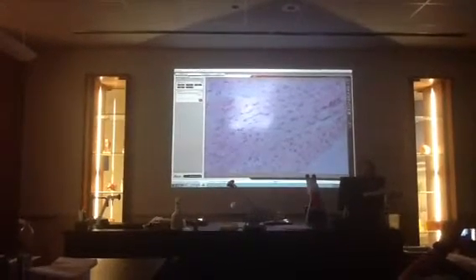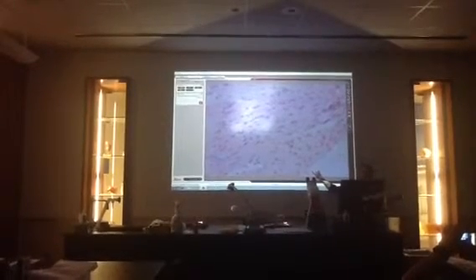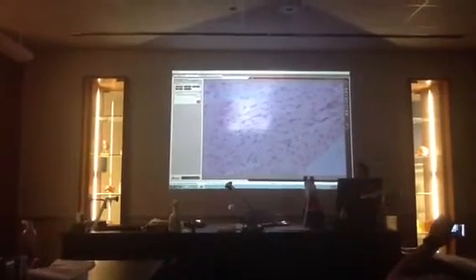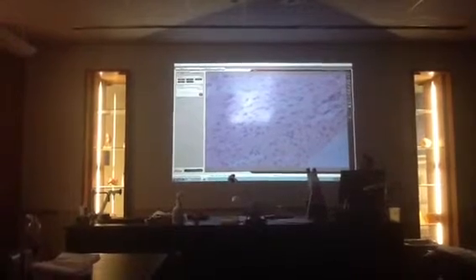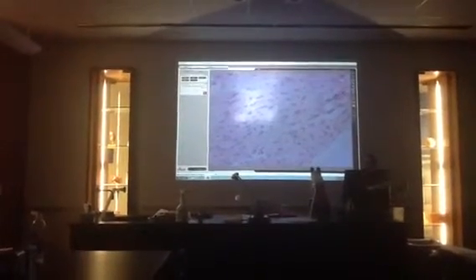Is the longitudinal layer adventitia? No, the adventitia is going to be the layer to the outside, you can barely see it right here. Usually that layer is not high on the list of things to ask you about, because sometimes it's difficult, in the field of view that we have, to set it up so that you see the outside of the layer. And sometimes you kind of need to know what organ it is to know what layer that is, and you can't get all of it in one field of view.